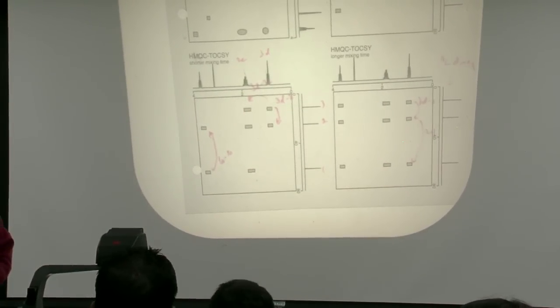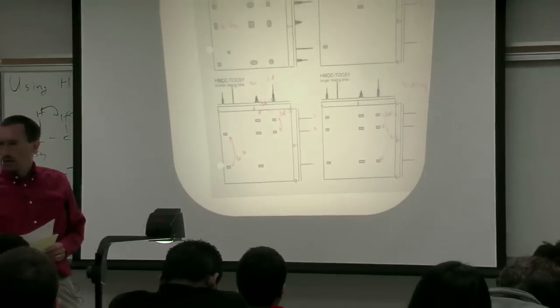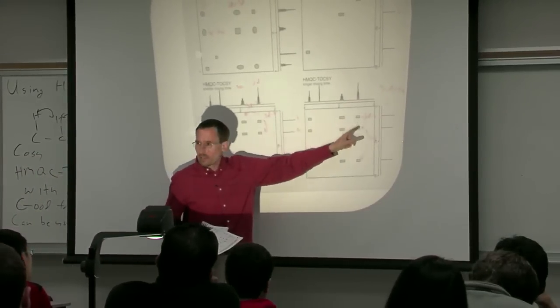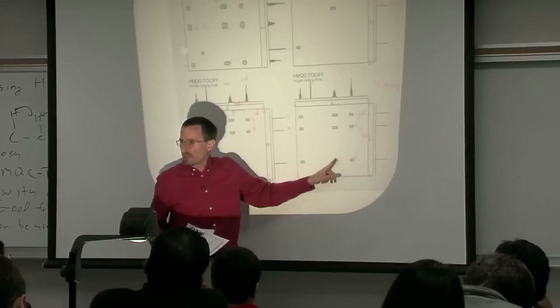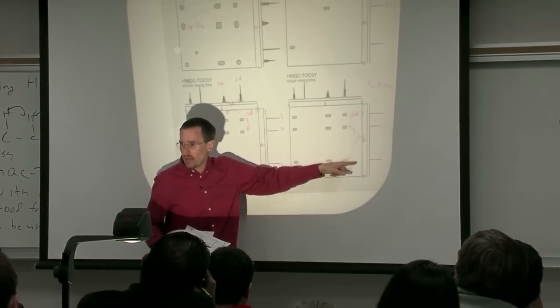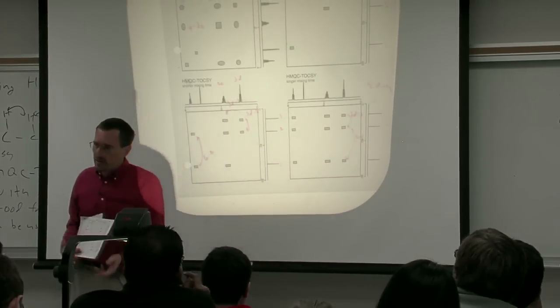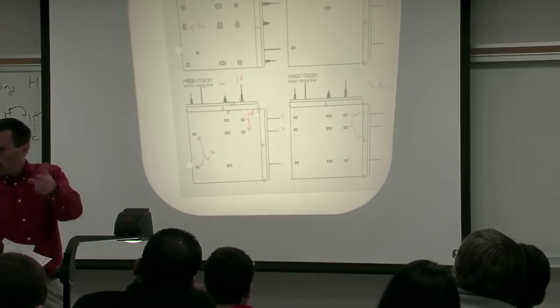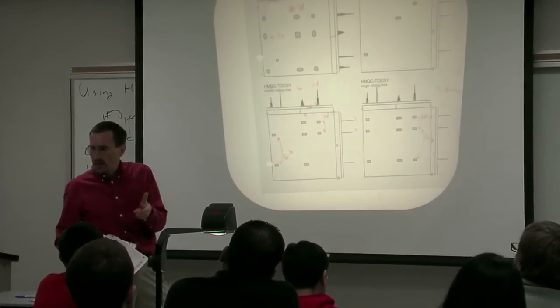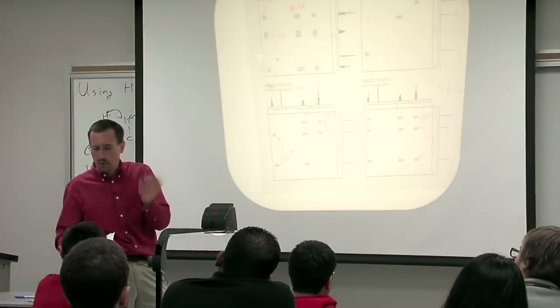Is there any big disadvantage to always using a longer mixing time? Well, the big disadvantage is you wouldn't get that sequential information. You wouldn't get it going from one to the next, to the next. The other disadvantage of a long mixing time is if you go too long, you've got relaxation working against you and signal to noise. But the main thing is here you're walking your way through.